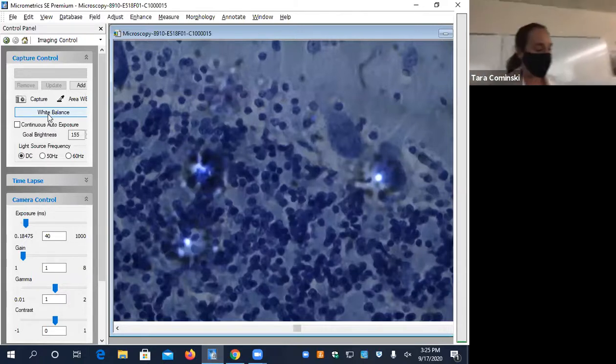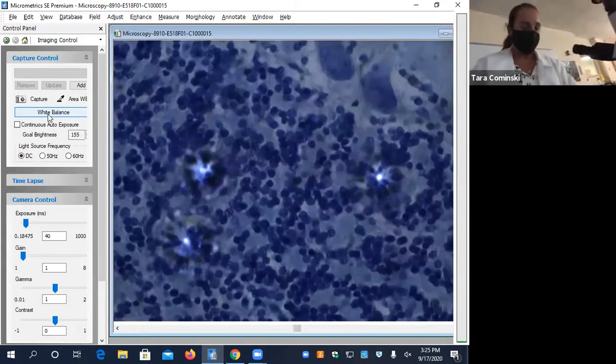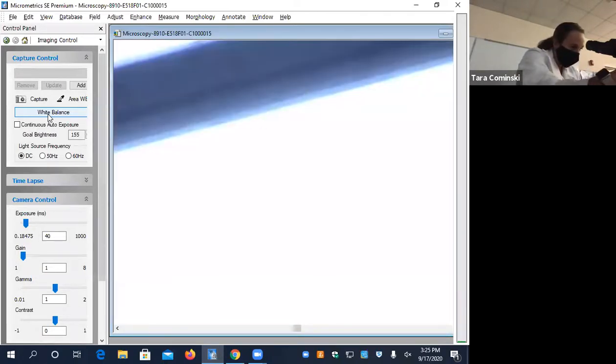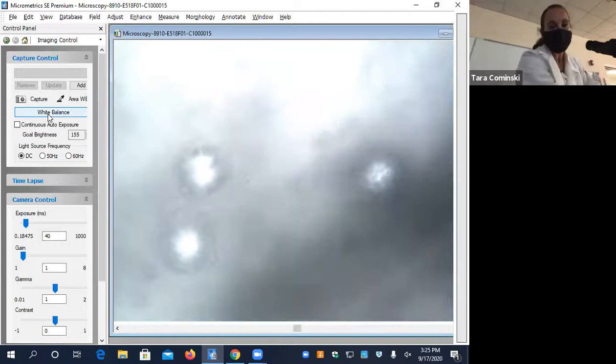What I'm showing you now is just a picture of a cerebellum, a slide of the cerebellum, part of the brain. Let me put my onion back in here. It's not very good, but it doesn't really matter. We can get the idea. Let me get it in focus for you.